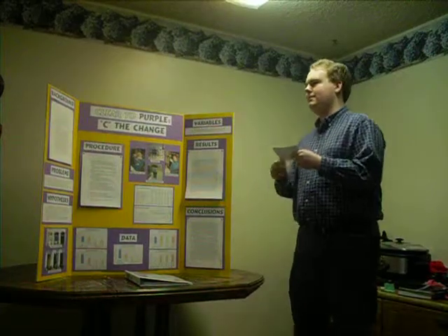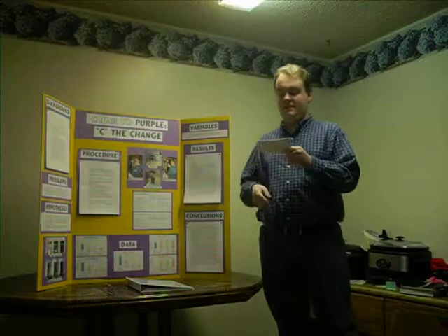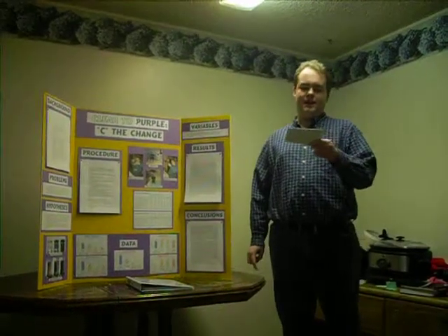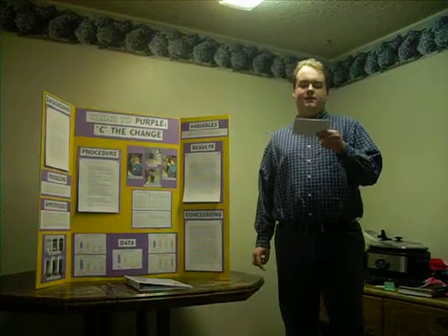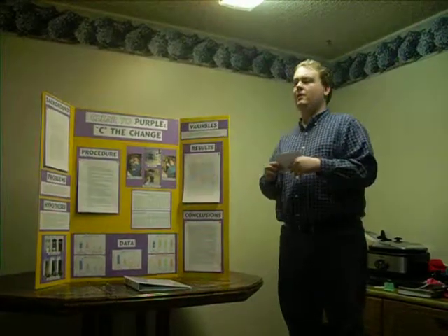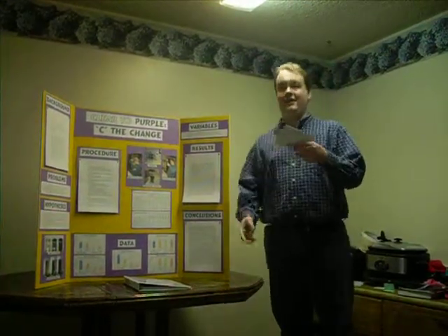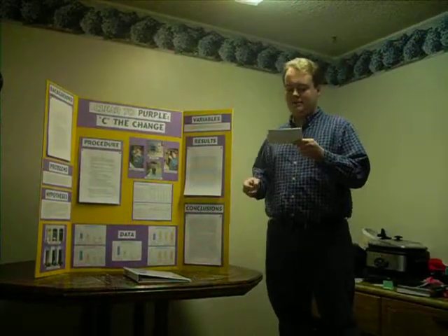I devised two problems to test in my investigation. The first one involved the vitamin C clock reaction. It is this: which of the following speeds up the vitamin C clock reaction most effectively at ordinary levels, i.e. not going to 1,000 degrees or anything? An increase in temperature, an increase in the amount of hydrogen peroxide, which is a catalyst in this instance, or an increase in the amount of iodine, which is a key reactant of the vitamin C clock reaction.